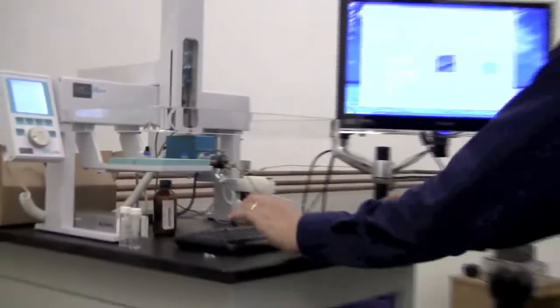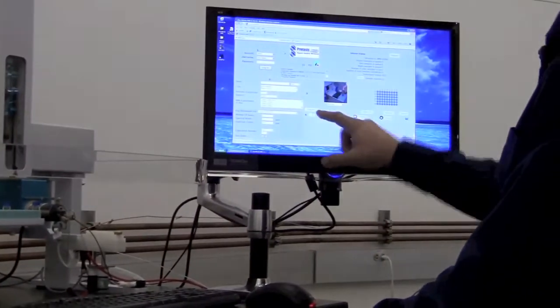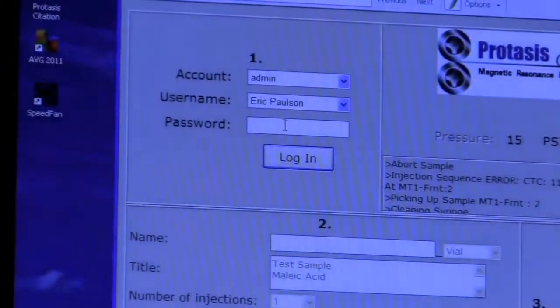Then come over to the system, and there's four numbers, and you need to do them in order. One, two, three, four. So first thing to do is to log in. Put in your username and then your password.